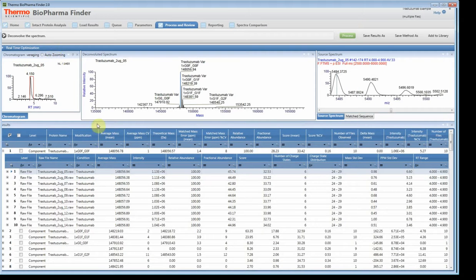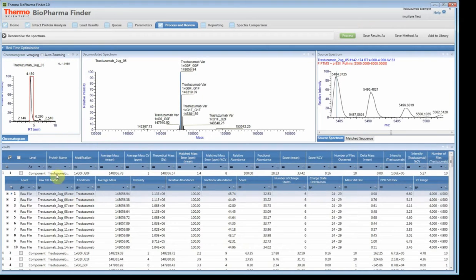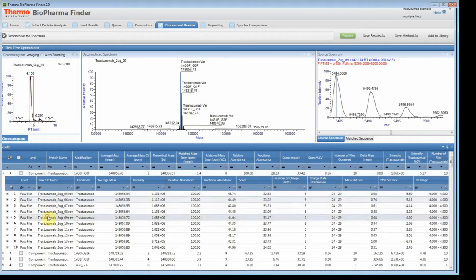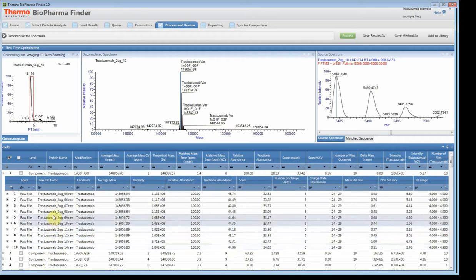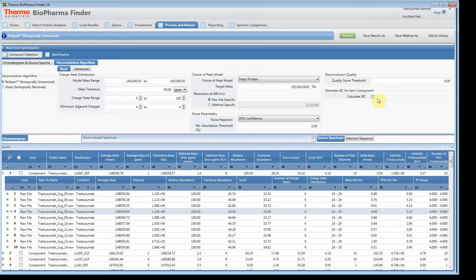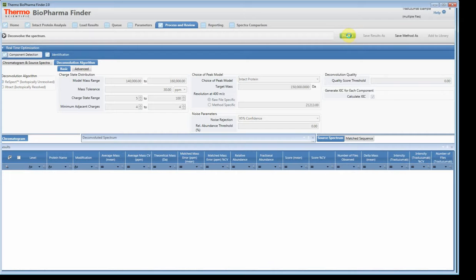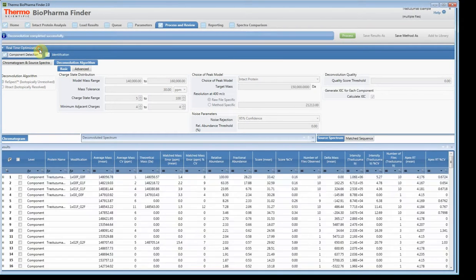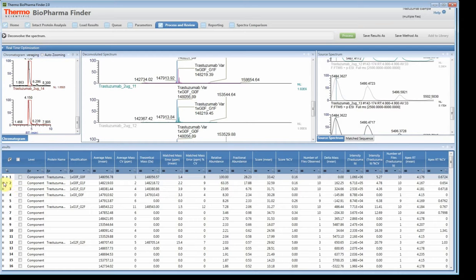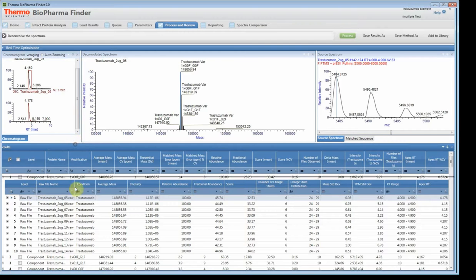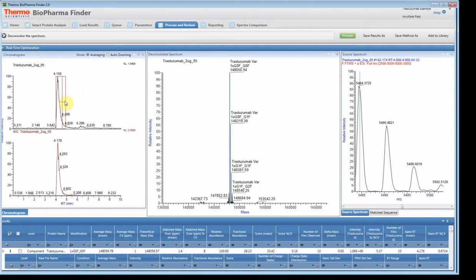If you turn on the XIC option and reprocess, you'll actually see the extracted ion chromatogram for each individual component at the raw file level. Let me turn that on and reprocess — it's pretty quick when you make changes. Now let me open this up a bit. This is the base peak for that individual file, and here's the XIC trace, which is just the trace. When calculating intensity, it's not actually coming from the trace — it's more of a visual image.